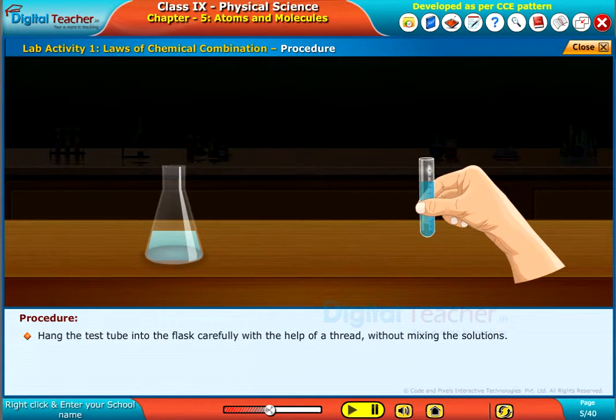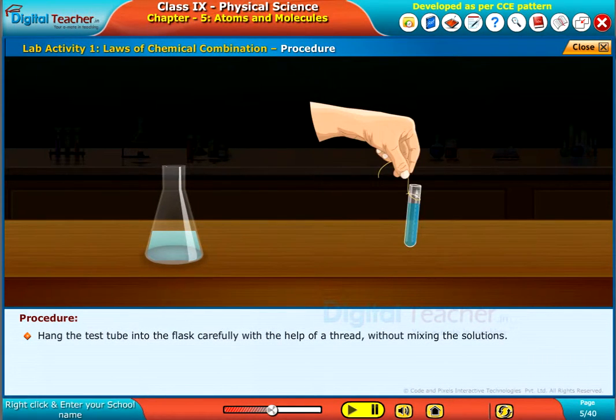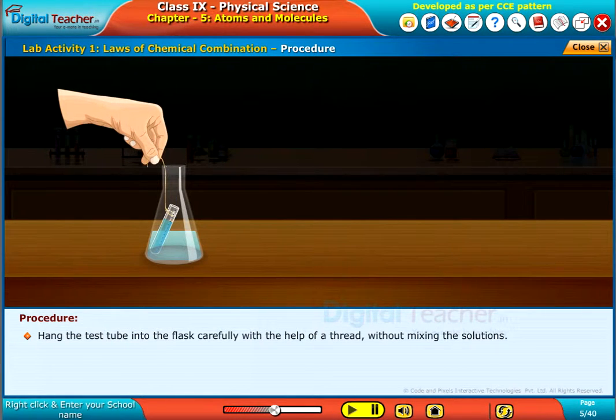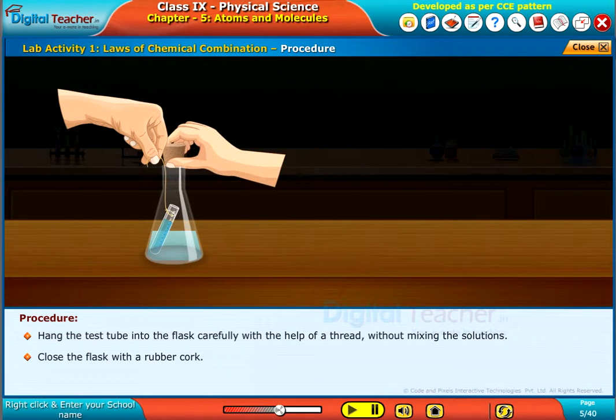Hang the test tube into the flask carefully with the help of a thread without mixing the solutions. Close the flask with a rubber cork.